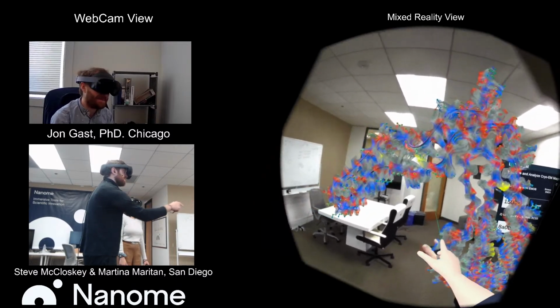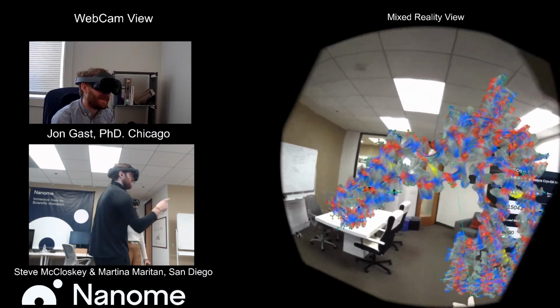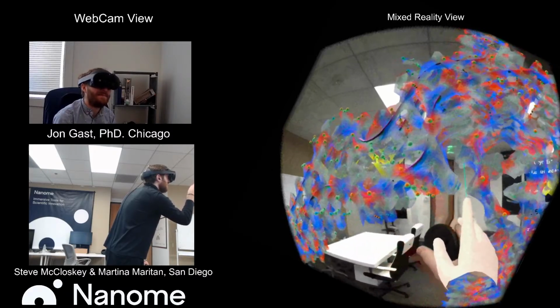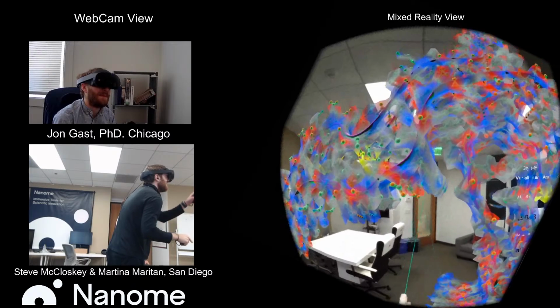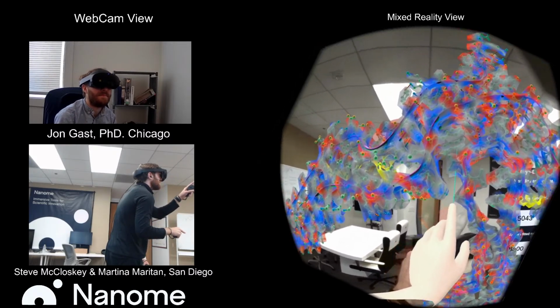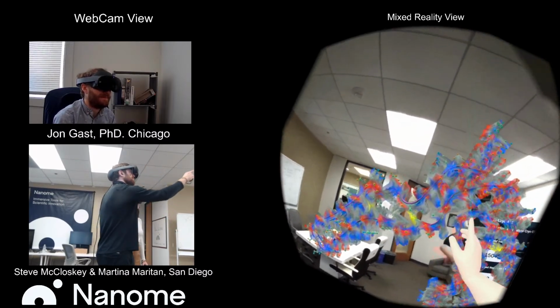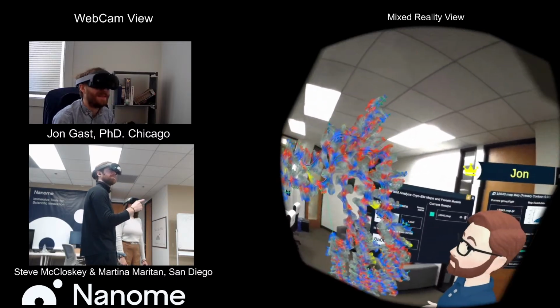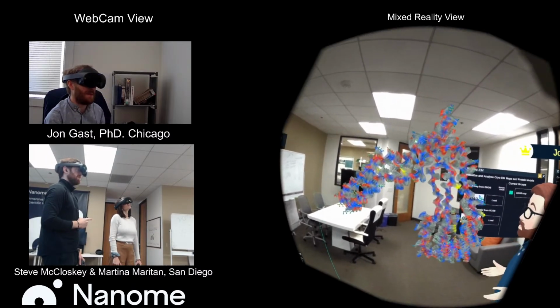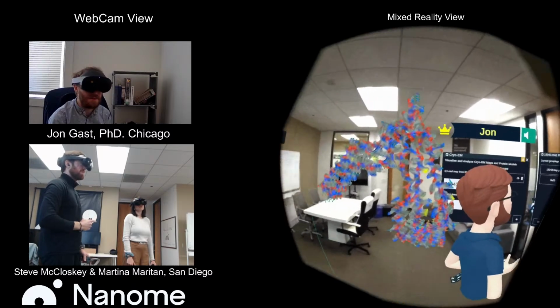Where researchers will say, because it's a few angstrom resolution, it's near atomic resolution. I mean, we could see it is really close, but it's not quite on a per atom basis. We see a little bit poking out on a single atom, and so you do get information about single atoms, but it's not really fully resolved atomic. But man, 2.6 angstrom, is that what you said? That is very good. It's close. It's not where we thought we were just a few years ago. It's great advances in the field.